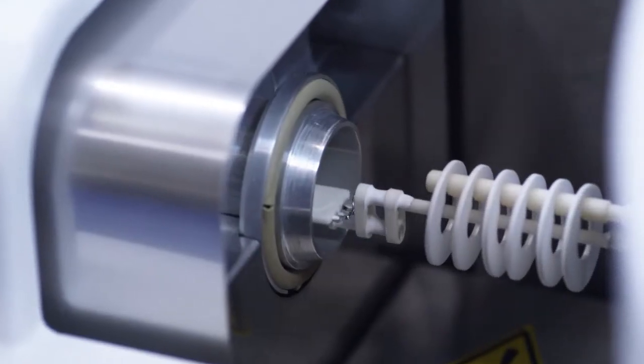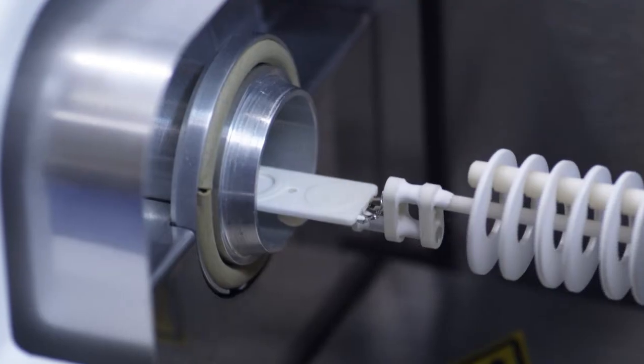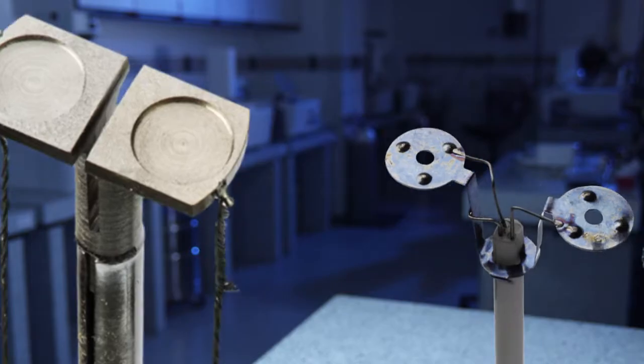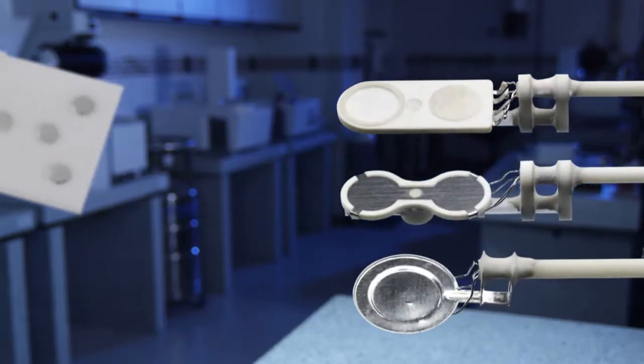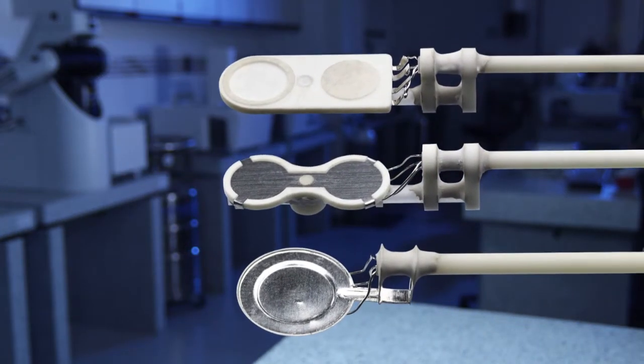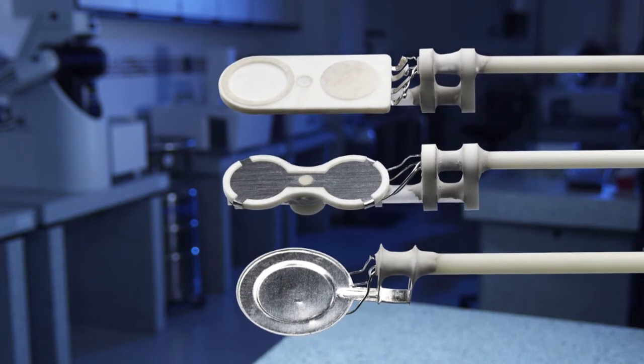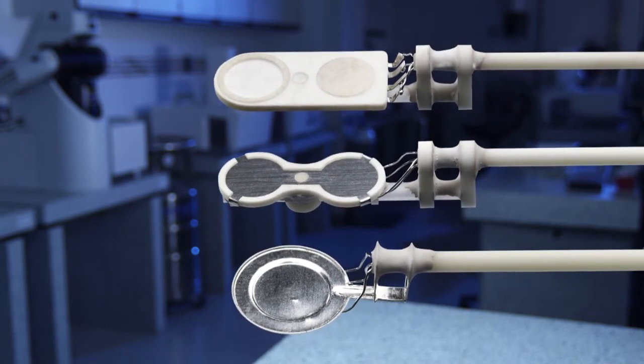The current multi-star TGA DSC sensors are the result of 50 years of company experience and innovation. The advanced multi-layer thermocouple technology with six thermocouples amplifies the measurement signal and thereby increases DSC sensitivity.